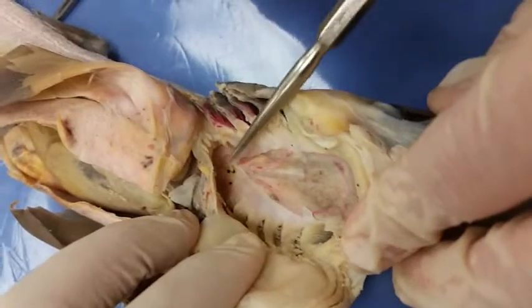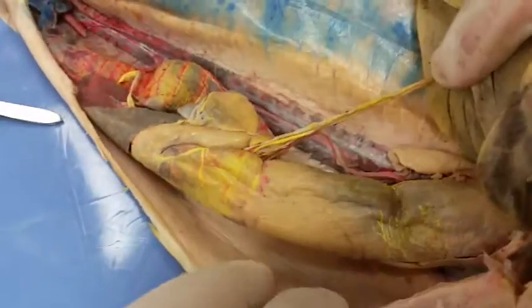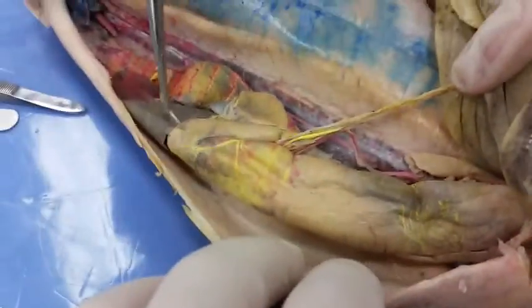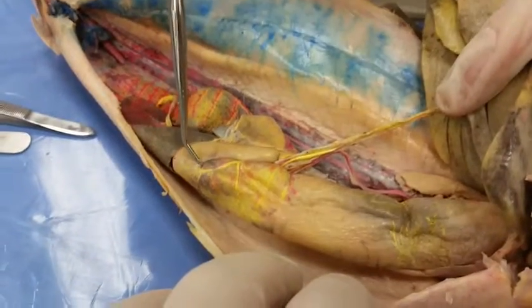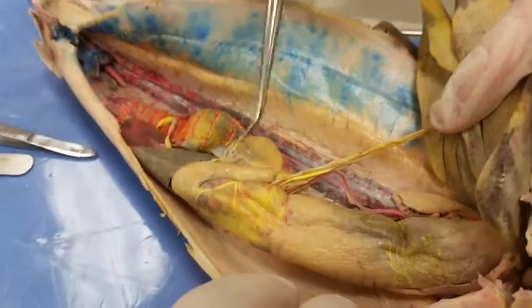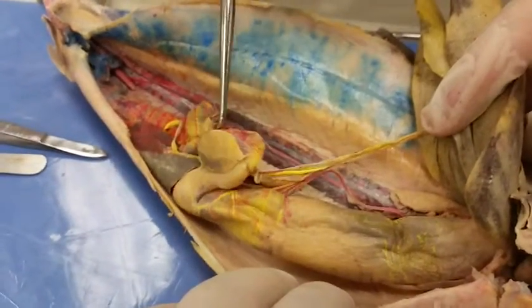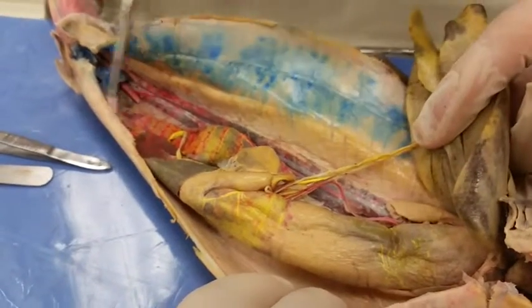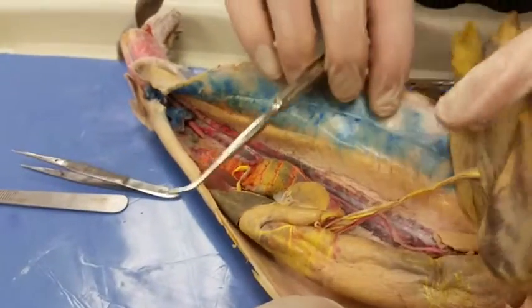The oral cavity leads into the esophagus, which leads down into the stomach, which has the greater curvature of the stomach right here on the outside, and then the lesser curvature on the inside. Then we have the lobes of the pancreas. We have the ventral lobe, and then the dorsal lobe on the bottom leads into the valvular intestine, right next to the spleen, and eventually all the way down into the cloacal opening.